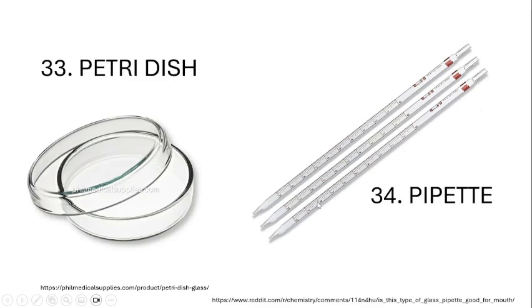Okay, so if you remember, pipettes are used together with your aspirator or your pipettor. So you are not allowed to use your mouth to suction liquids using a pipette. So that is hazardous and it is dangerous. Okay?